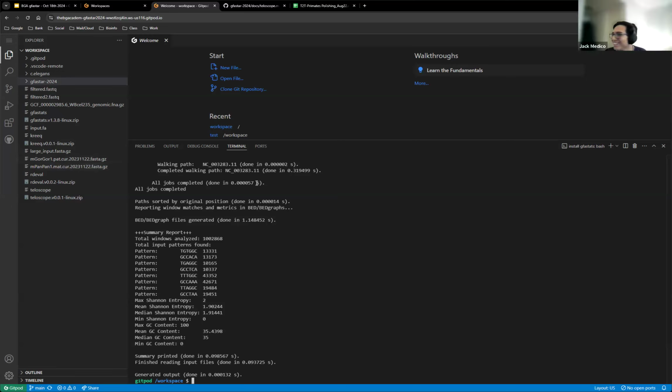All right. So we can explore how these C. elegans outputs look. K gives you the information of all the repeats, but we're interested in these 3 files, the telomere blocks. So in this case, the telomere in C. elegans goes from 0 to 774, but because we used a small D value, it was fragmented, because from 432 to 572 there are almost 150.